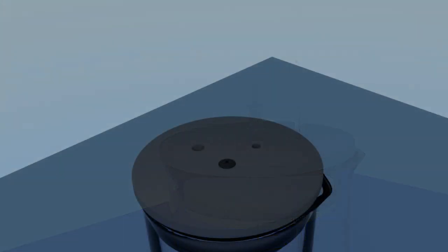Each stopper includes an immersion thermometer and a set of quick connects, both female and male.